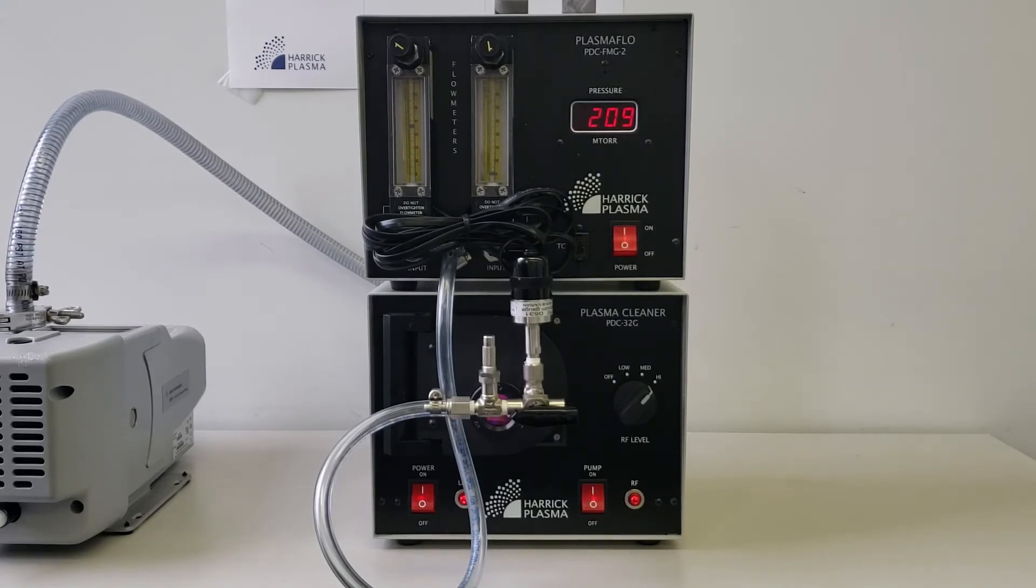While air plasma is often sufficient for bonding PDMS to glass, oxygen plasma is recommended if you plan to bond PDMS to PDMS or if you plan to use alternative materials. If you are located in an environment prone to daily fluctuations of relative humidity or particulates in your ambient air, you may want to consider dry compressed air or oxygen.